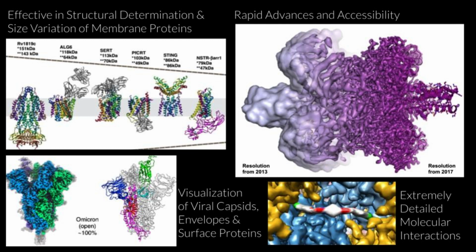The field of cryo-EM is experiencing rapid technological advancements, making high-resolution structural biology more accessible to researchers. This image on the top right is a comparison of how much the imaging has improved from 2013 to 2017, and the technology has only gotten more advanced since then.